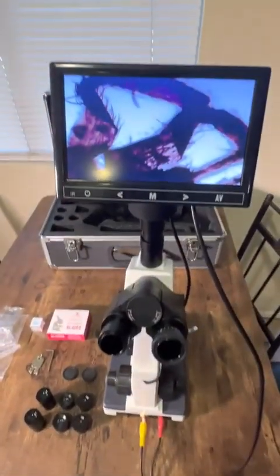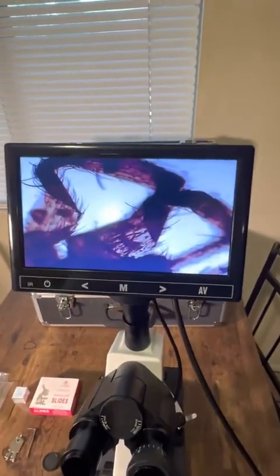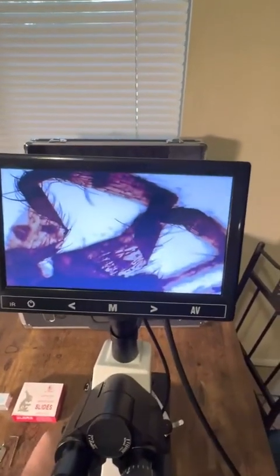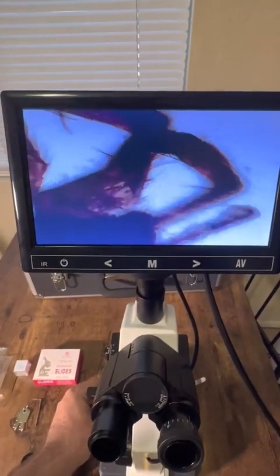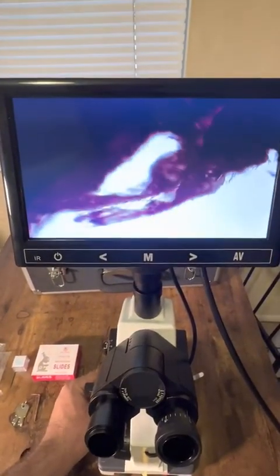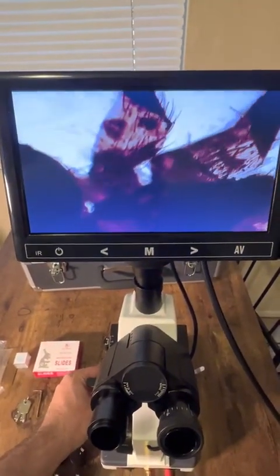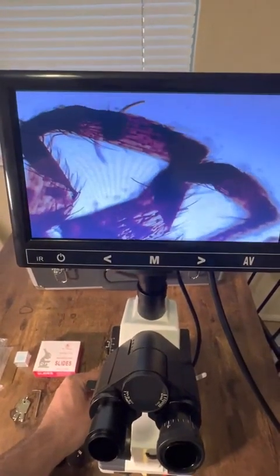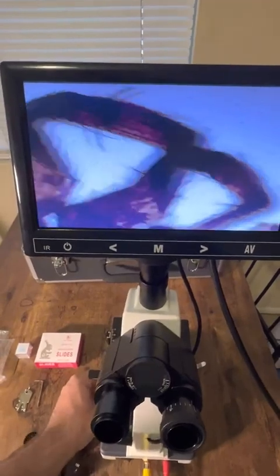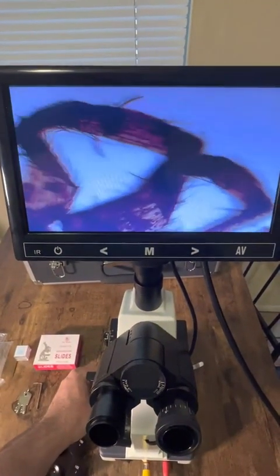The best feature about this is this screen. Here I have just a little common house spider up on display. It moves super easily — you can move it down and everything feels nice and smooth. It's not like a cheap microscope where you have trouble moving it and it jolts around. Everything moves nice and smooth here.